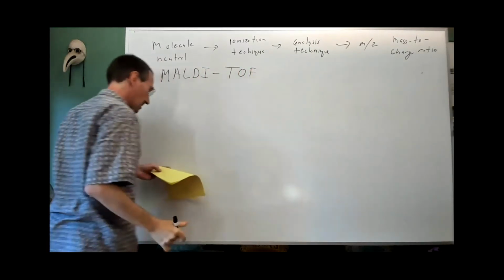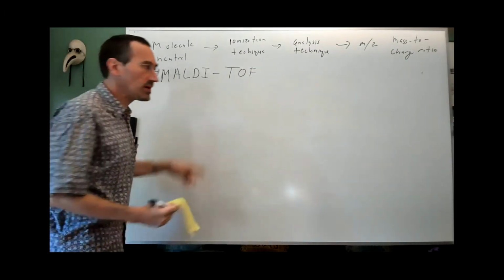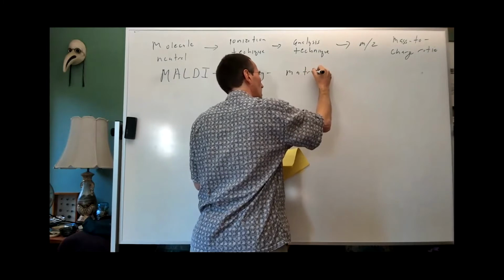you're getting the molecule into the gas phase and putting a charge on it by matrix-assisted laser desorption ionization.